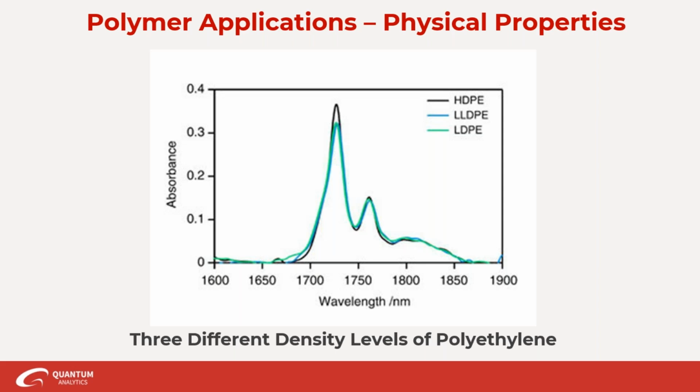Polyethylene is a thermoplastic that's made through the polymerization of ethene. It's used in a lot of things: packaging films, toys, pipes, and housewares. And there have been different levels of density developed based on the density of the material and the branching of the molecular chain. So the 3 types that you're looking at here are high density polyethylene, linear low density, and low density polyethylene.